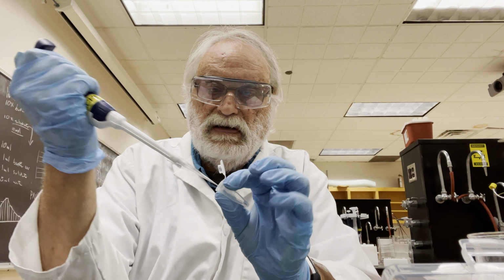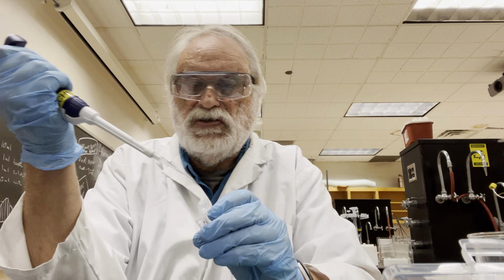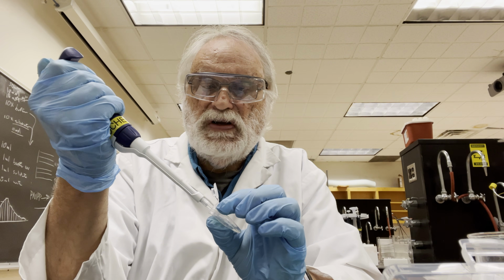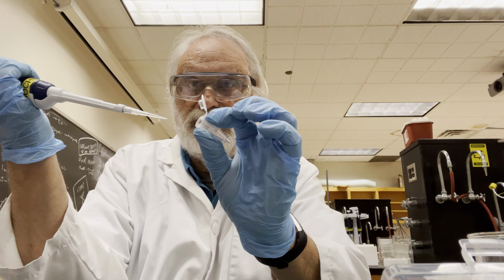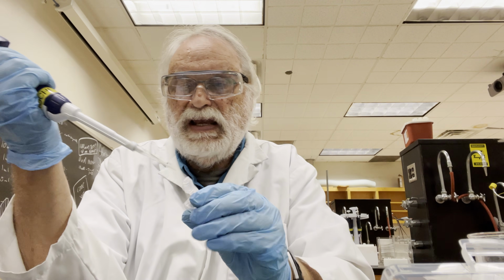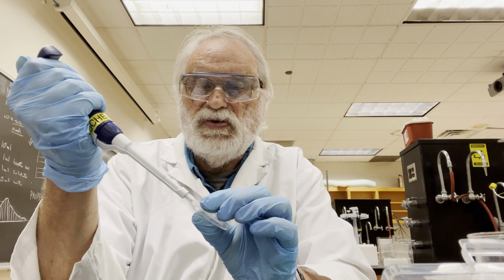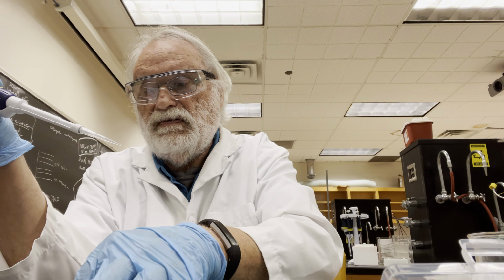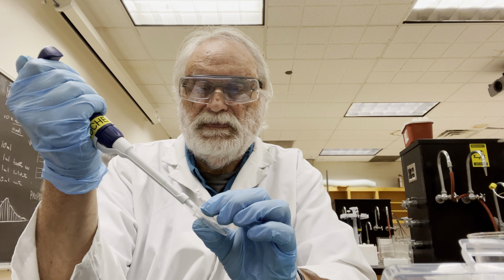So I've mixed it. Now next I will take 50 microliters out and add that to the next tube. Notice what I did is I went ahead and picked the tube up. I closed the tube off so I know that I've already taken the sample out of it. And I've taken the 50 microliters out, close that tube. Then I'll pick up the next tube and add 50 microliters. This is the way that I go ahead and do it to make sure that I haven't made a mistake. Just keep doing that for each of these samples.